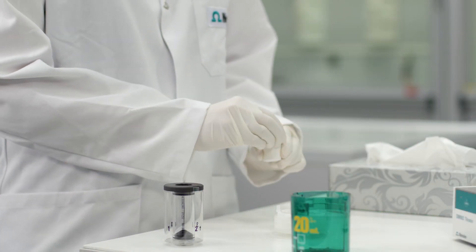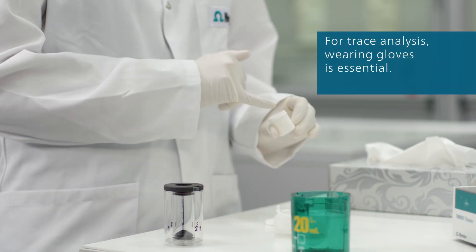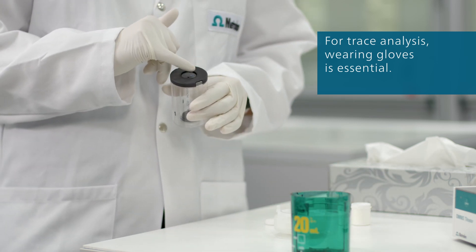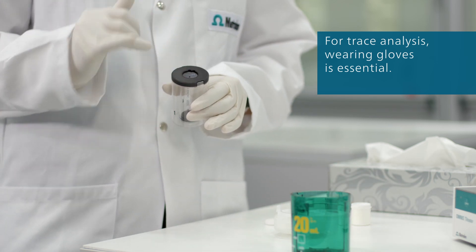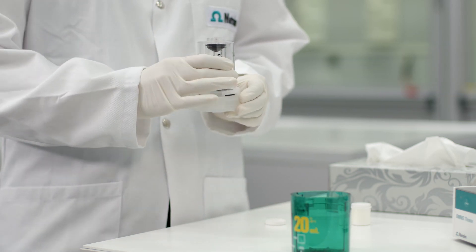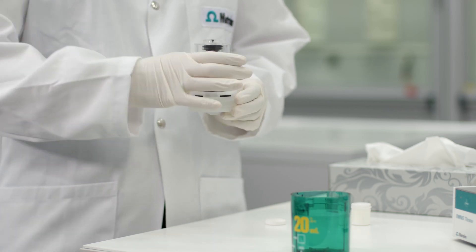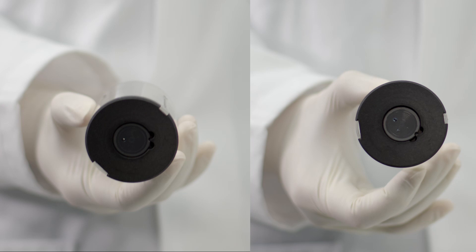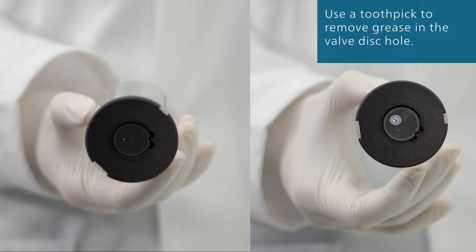As soon as all parts are completely dry, you can lubricate them. Put a little grease onto your fingertip and place three dots on the valve disc. Place the valve disc on the distributor and rotate it a few times to uniformly distribute the grease. Check that the lubricant is distributed uniformly on the valve disc. Remove any excess grease from the valve disc hole.